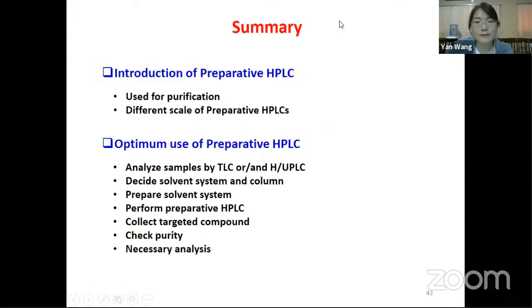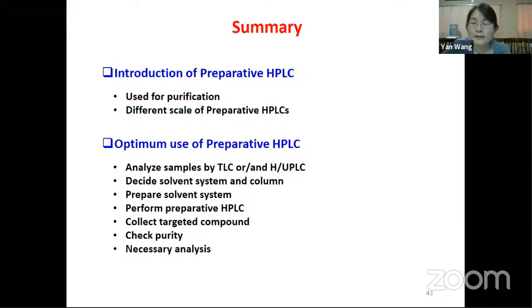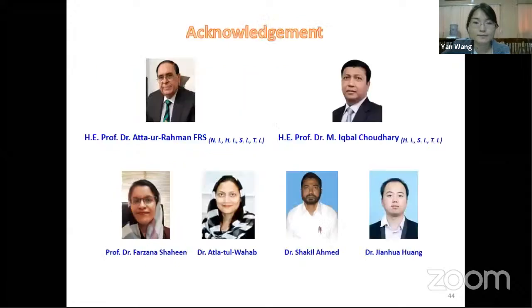So we have done the introduction of the preparative HPLC, and we know it's very different. Preparative HPLC is used to purify your compound, not to analyze your compound. And we have done the different steps of the preparative HPLC, so you can have a clear idea about what to do, right? If you have further confusions, you can contact me or my student for further discussion.